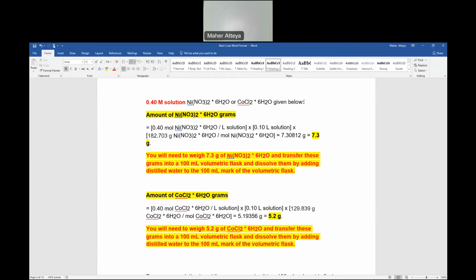Small beakers. You can use small beakers. Well, with the class, you might have to look around. Open here, inside. You have to look. Yeah, they are inside. The ones here are 200. Those are too big. The ones here are 200.